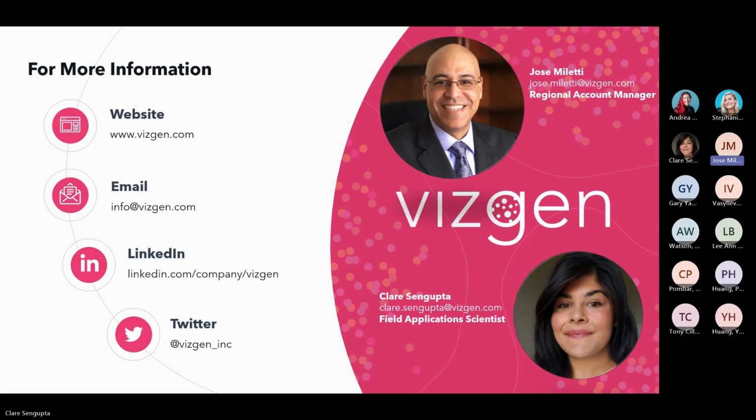All right. So the first one is around segmentation. So the question is, is the segmentation done on membrane staining images or reads? That's a really great question. So we have two options for segmentation built into our software. So one is watershed segmentation, which is seeded on DAPI stain, which is incorporated into all of our sample preparation.